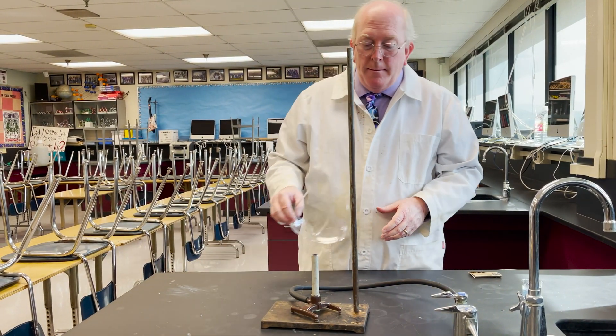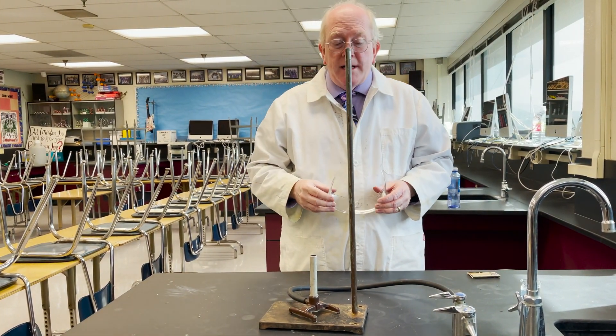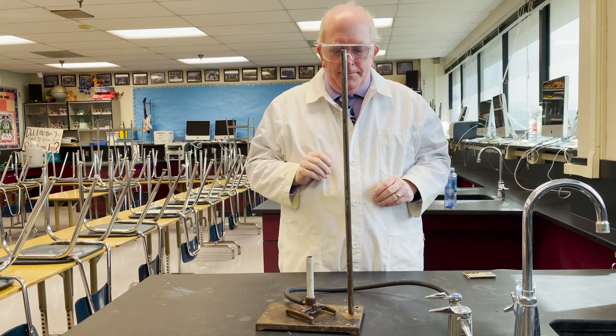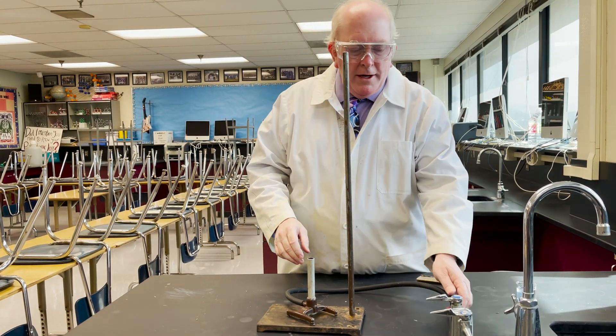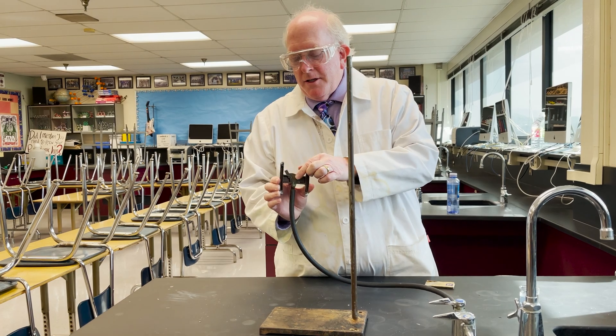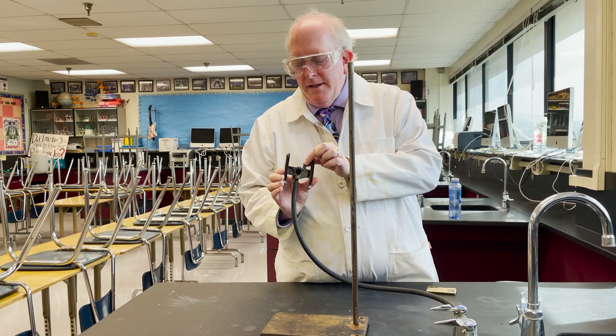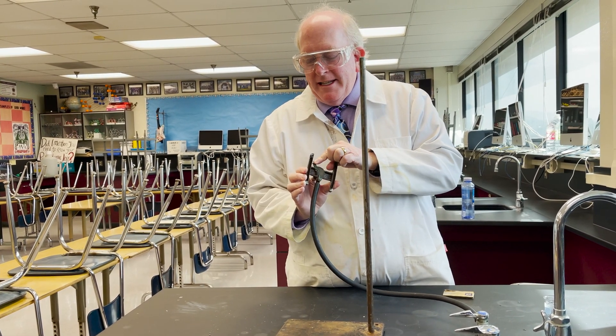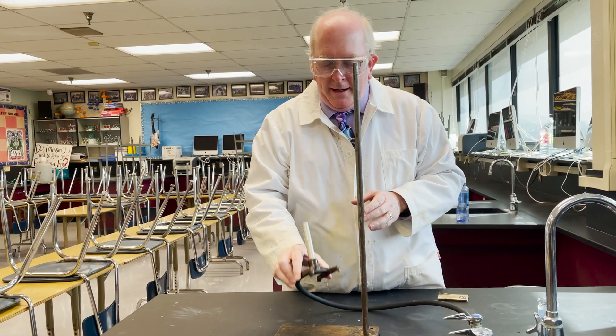Now it's an open flame. We have some concerns for safety here, so let's practice safe science — wear some safety glasses. When you have the hose on, set the bottom of the Bunsen burner to be closed. This controls whether it's open or closed. When we're using it, it's going to be halfway open, but it's easier to light it when it's all the way closed.